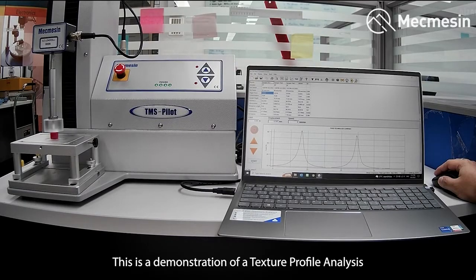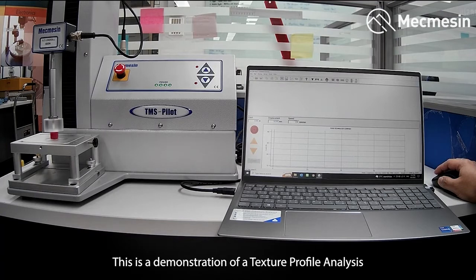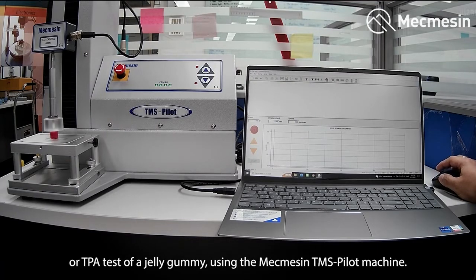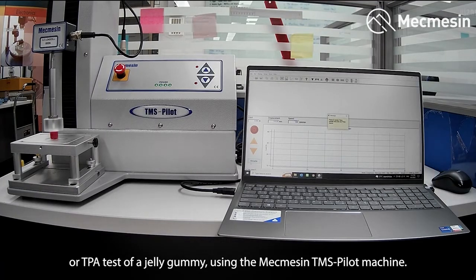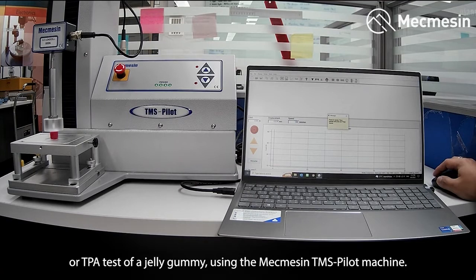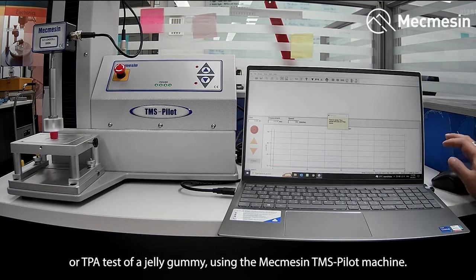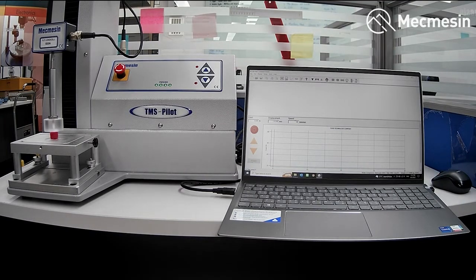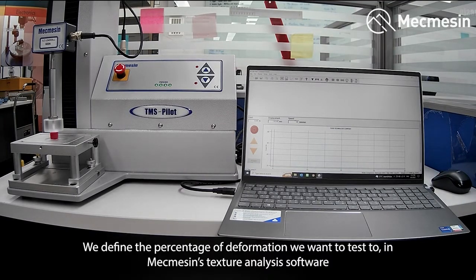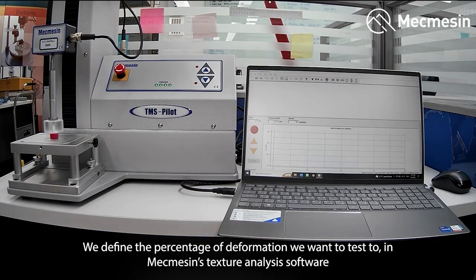This is a demonstration of a Texture Profile Analysis, or TPA test, of a jelly gummy using the Mecmesin TMS Pilot machine. We define the percentage of deformation we want to test to in Mecmesin's texture analysis software.